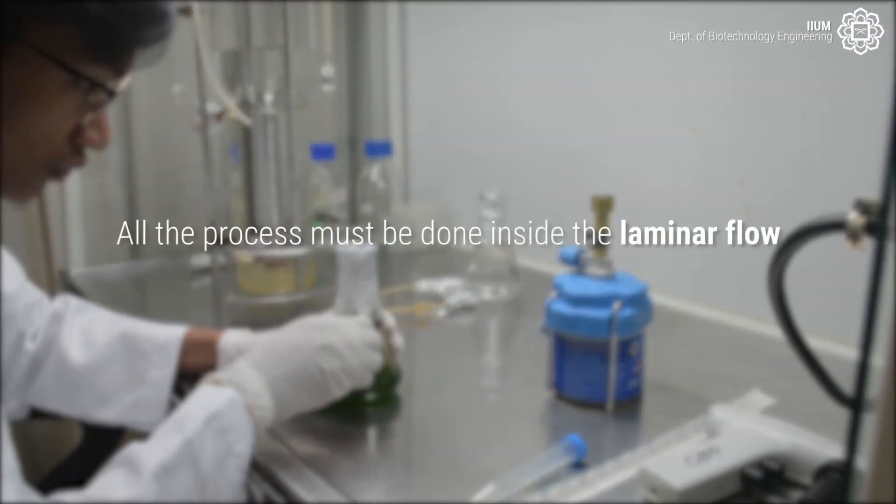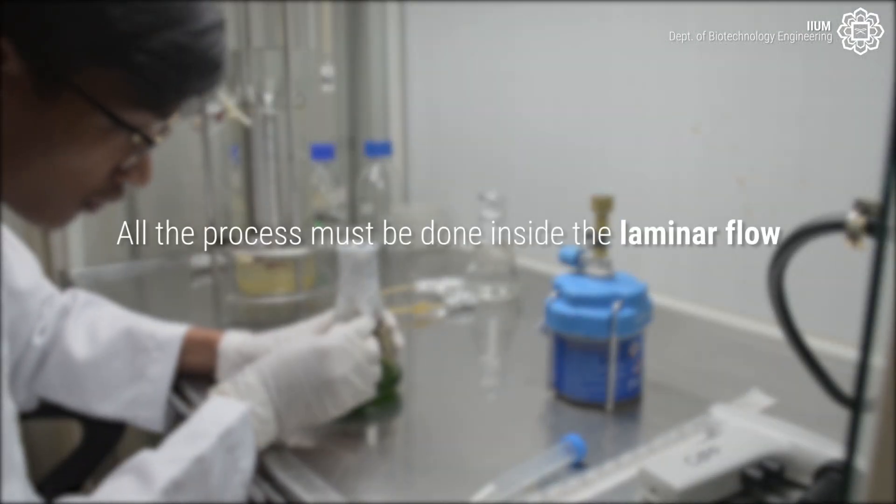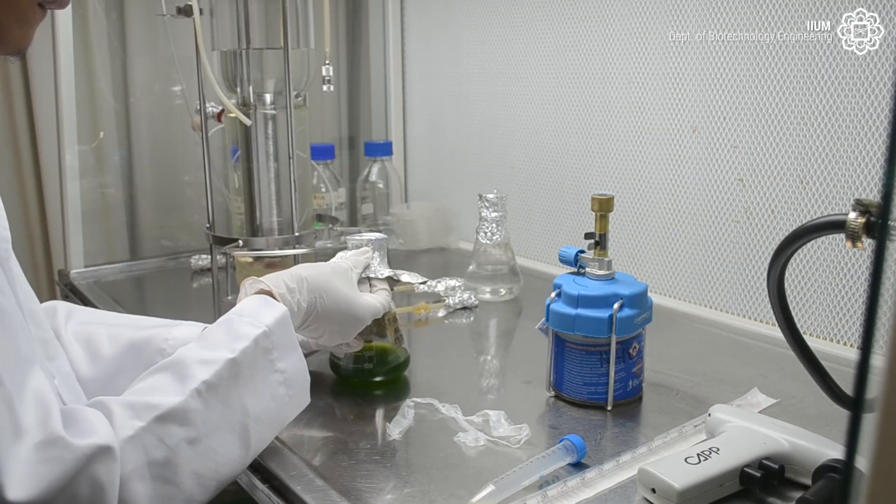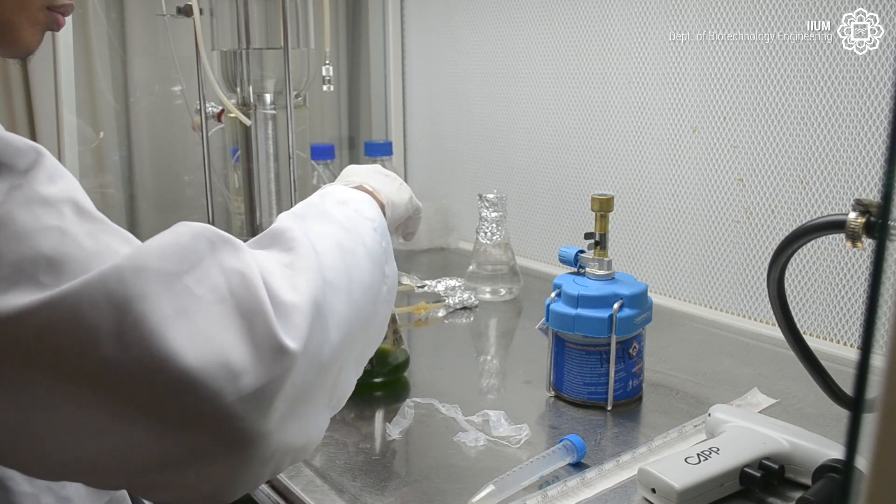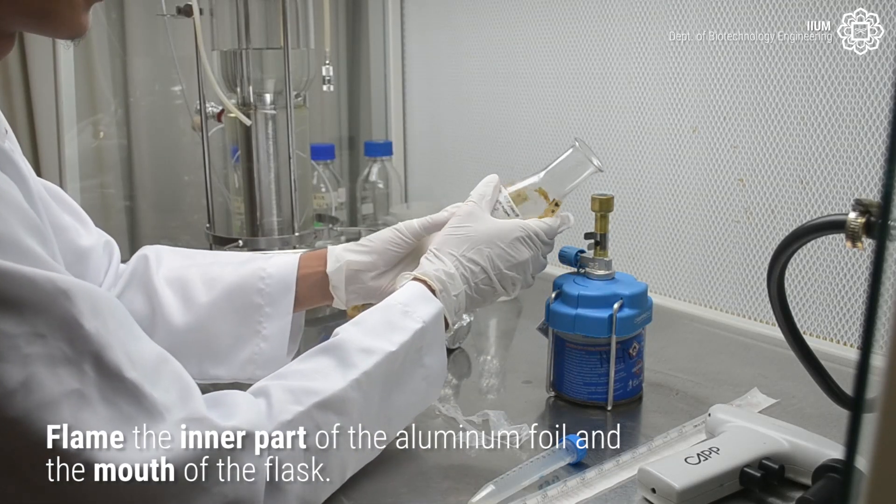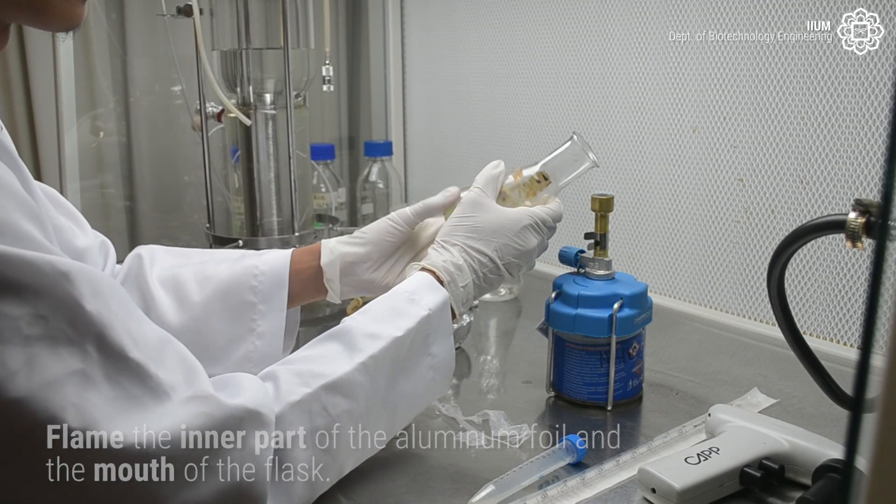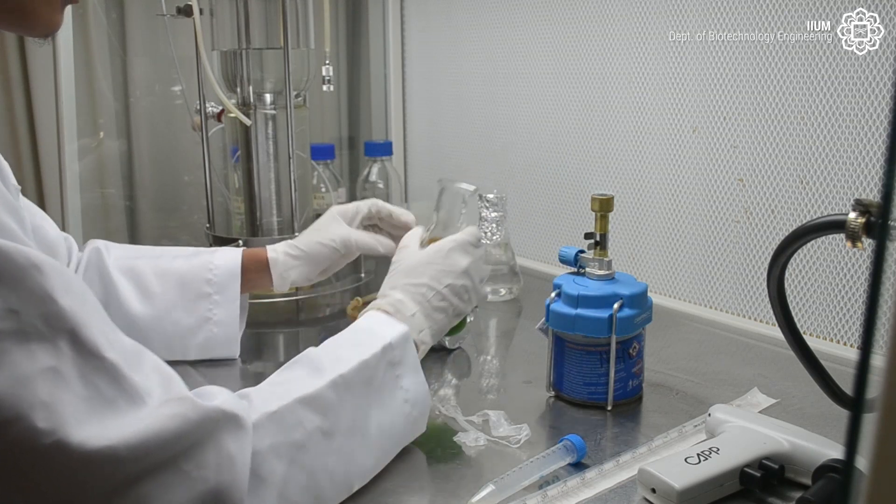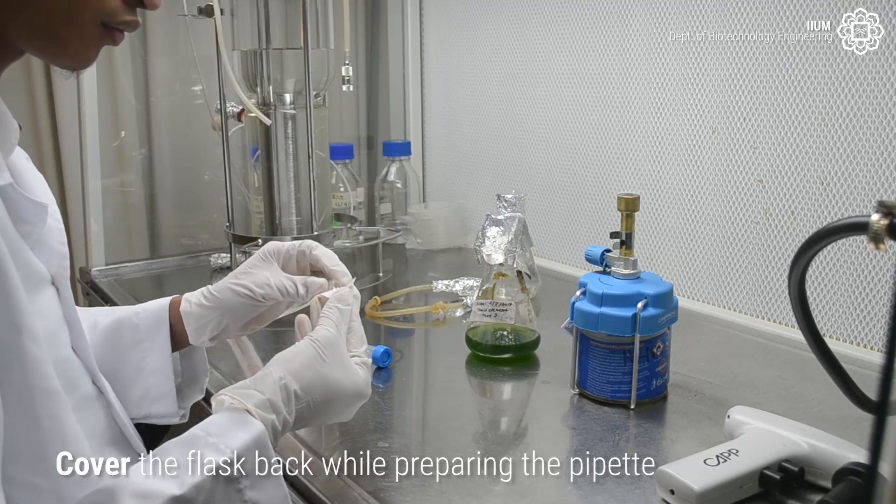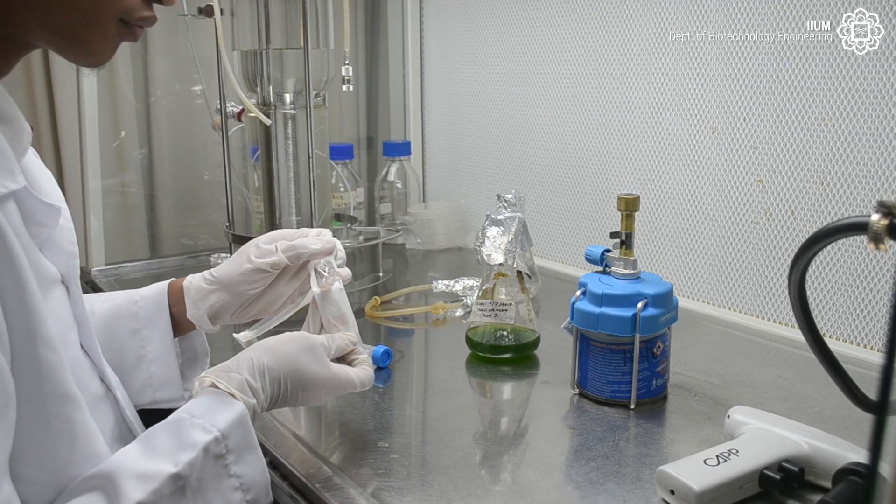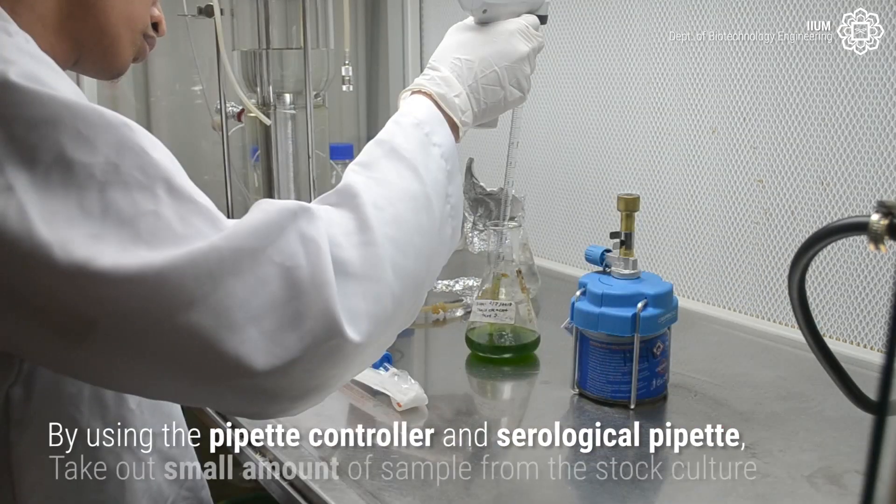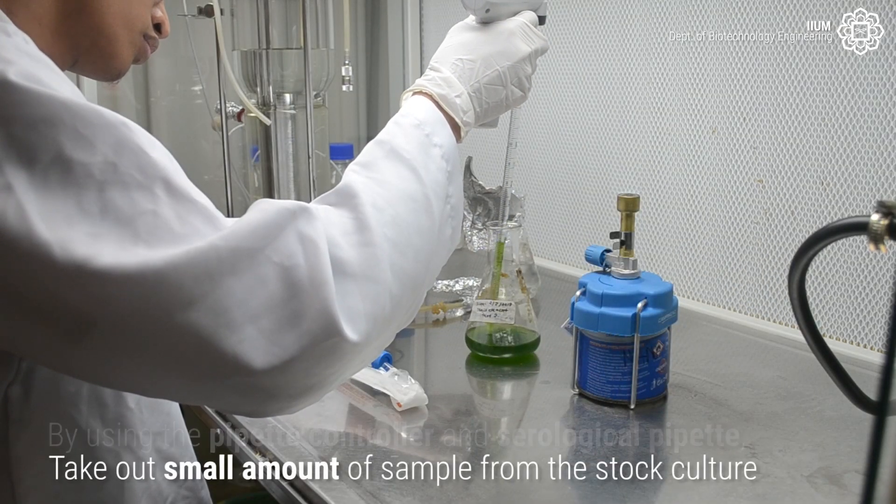All of the process must be done inside the laminar flow. Flame the inner part of the aluminum foil and the mouth of the flask. Cover the flask back while preparing the pipette. By using the pipette controller and serological pipette, take out a small amount of sample from the stock culture.